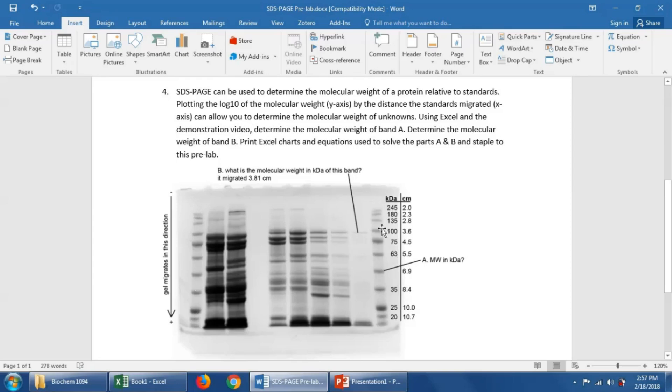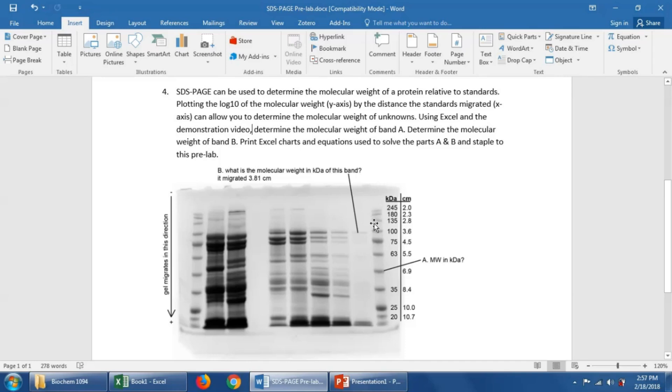For example, this very first band is 245 kilodaltons and it migrated 2 centimeters down into the gel. This third band is 135 kilodaltons and it migrated 2.8 centimeters down into the gel.